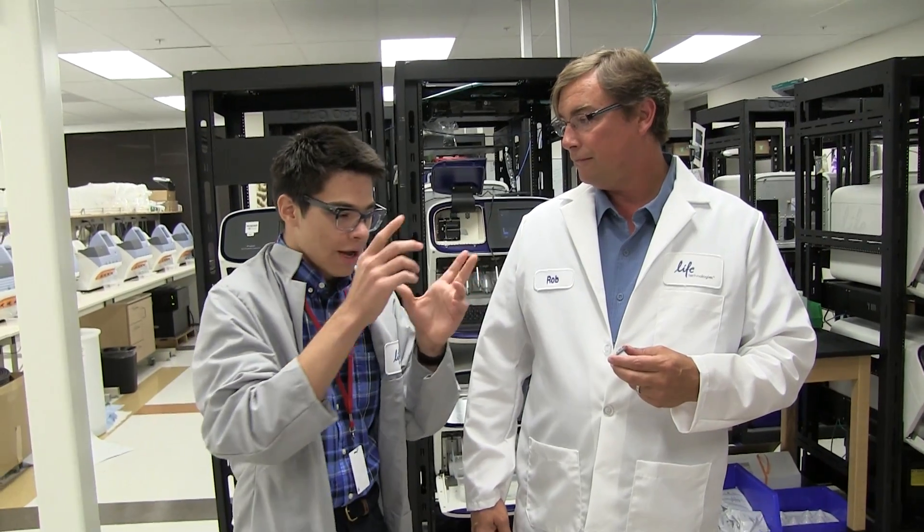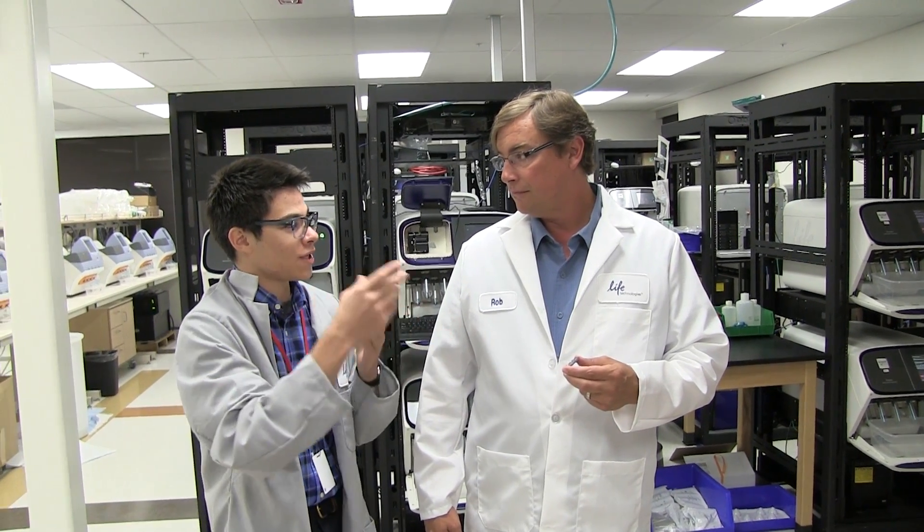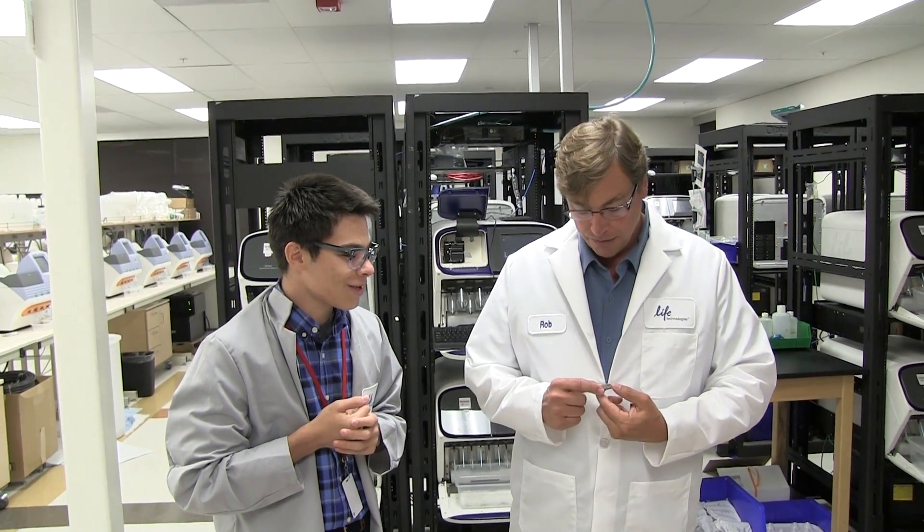Instead of having millions of pixels like the chip in this camera, on this chip we have millions of wells. Those wells are each going to receive a fragment of DNA, and we detect whether or not a proton is released during the incorporation of a nucleotide. Actually, I misspoke — this chip has 12 million wells. That's a lot of wells.